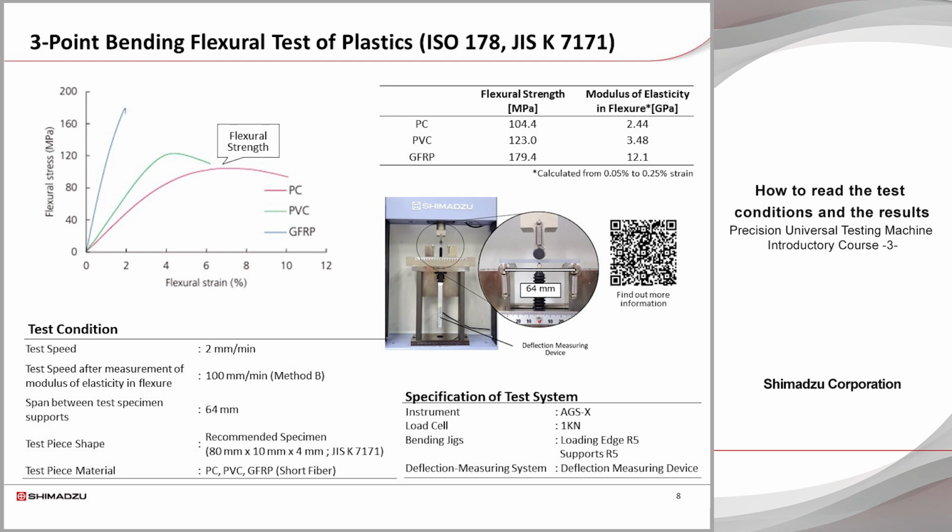In order to accurately measure the bending deflection of the specimen in this test case, the standard states that a bending deflectometer should be used that meets the measurement accuracy calculated from the specimen's thickness. For this reason, a contact-type bend deflectometer was used in this test to meet this accuracy. In many cases, the specimen does not rupture in a bending test, and the test is often terminated after the bending strength, which is the maximum stress, has been measured.